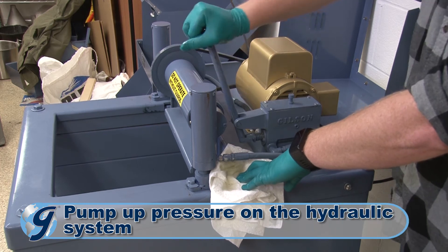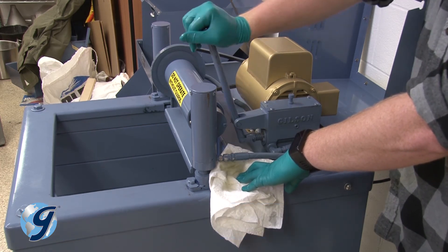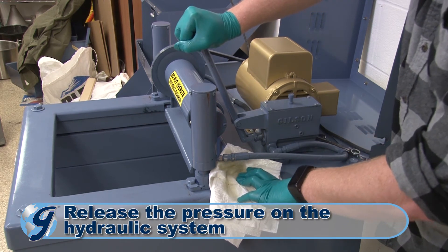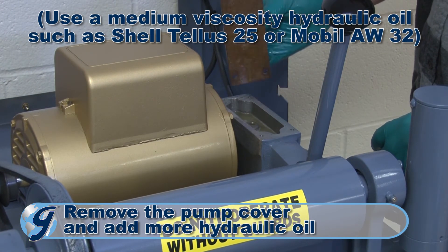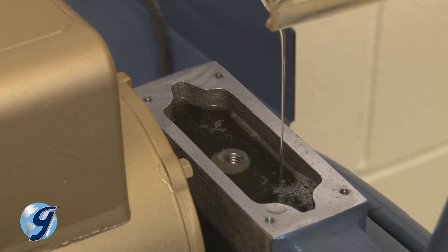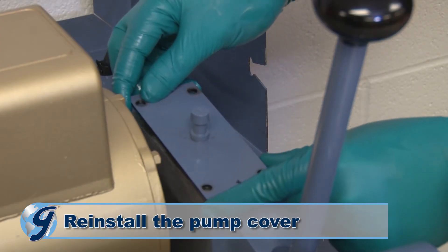Pump up pressure on the hydraulic system with short strokes on the pump handle. Now, release the pressure by moving the handle all the way towards the front of the machine. Next, remove the pump cover and add more hydraulic oil if necessary to fill the pump reservoir to within a quarter inch from the top. Once you have confirmed the hydraulic oil is a quarter inch from the top of the oil reservoir, reinstall the pump cover assembly.